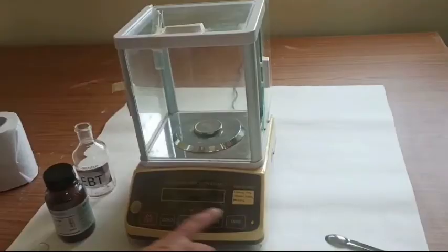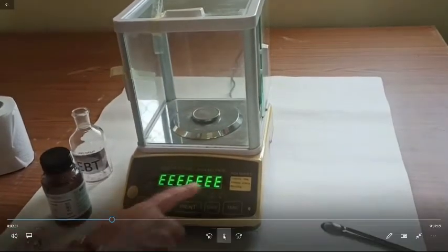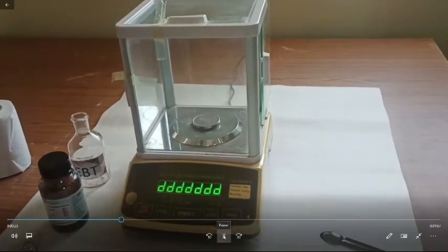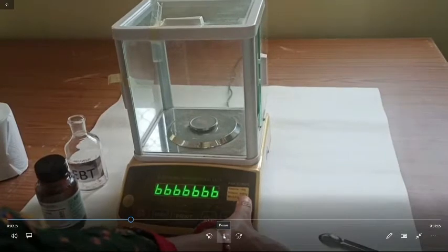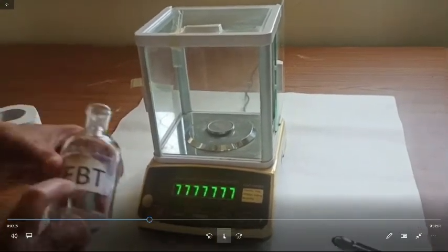Here is our electronic balance. So first let's put on the power button of this electronic balance. This is initializing first. These are the capacity, least count, and the weight is measured in grams.